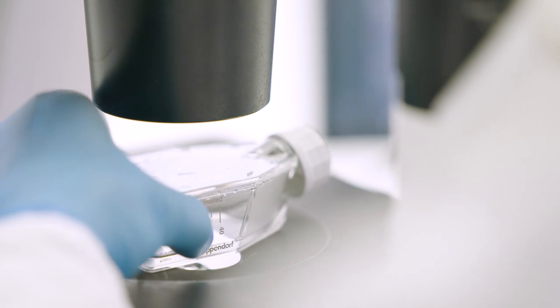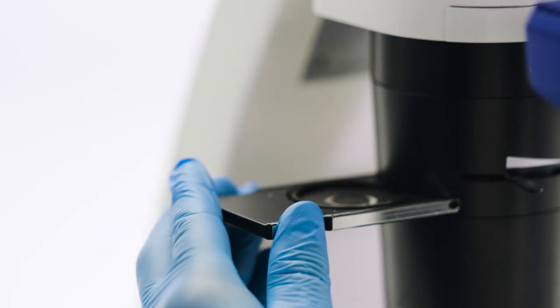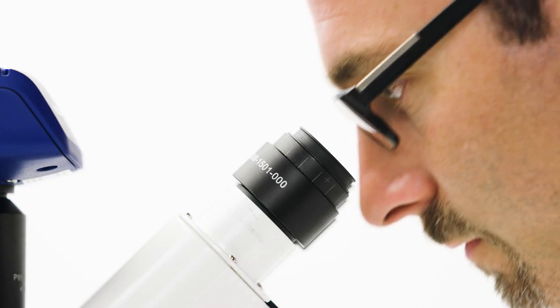Do you work with adherent cell cultures? Then estimating cell confluency is a known procedure to you.